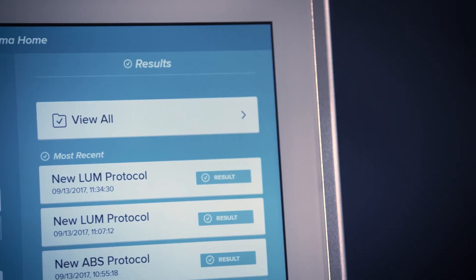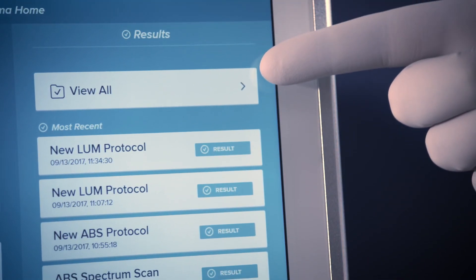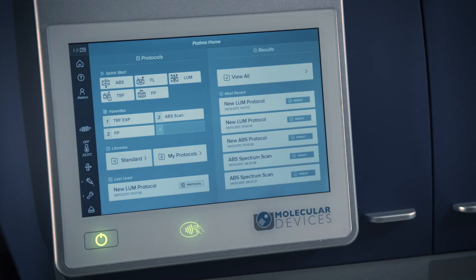The right side of your home page features your results. Your most recently acquired results are displayed with time and date stamps for easy viewing. Now that the SpectraMax ID has been introduced to you, it's time for the SpectraMax ID to get to know you. Watch the video entitled 'Personalizing your SpectraMax ID Reader' to learn about instrument personalization.